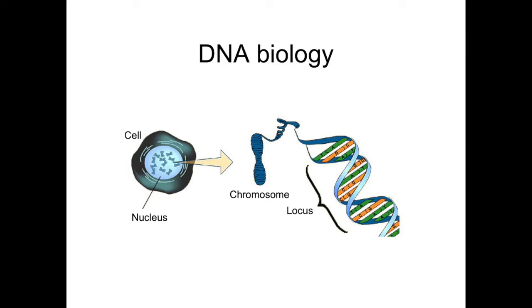And then the output is to measure how long the DNA is. That's done on a DNA sequencing machine, sometimes called a genetic analyzer. So this was back in the day, the 1990s, when sequencing was very expensive, but measuring the length of DNA fragments was very cheap. So the idea was to measure not the content of the DNA sentence, but its length. Because there was an exact correspondence.